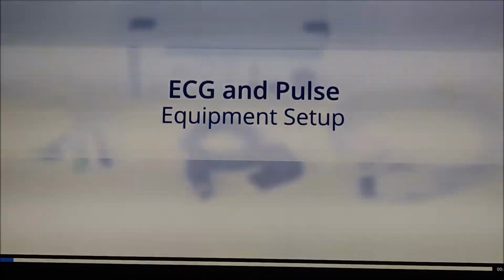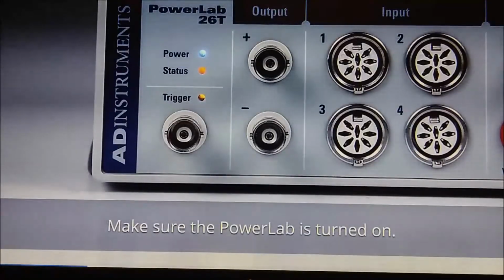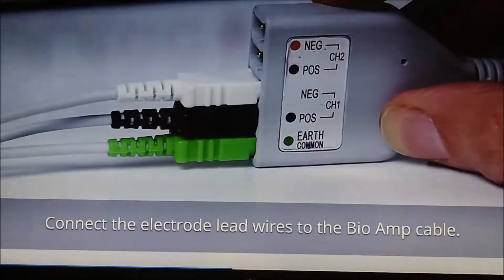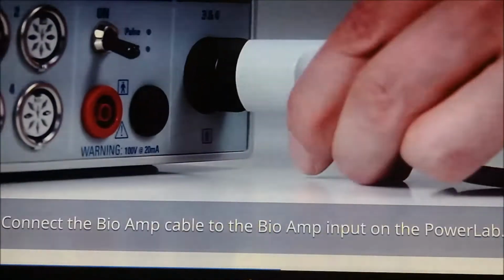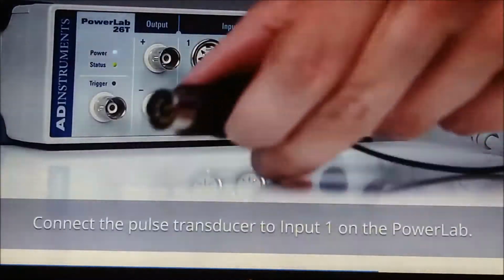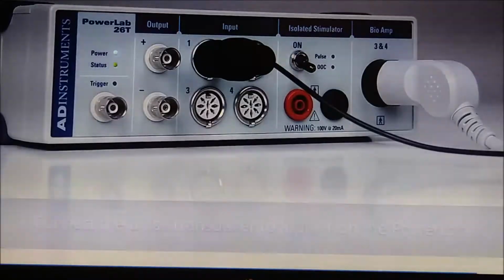ECG and pulse equipment setup. Make sure the PowerLab is turned on. Connect the electrode lead wires to the bioamp cable. Connect the bioamp cable to the bioamp input on the PowerLab. Connect the pulse transducer to input 1 on the PowerLab.